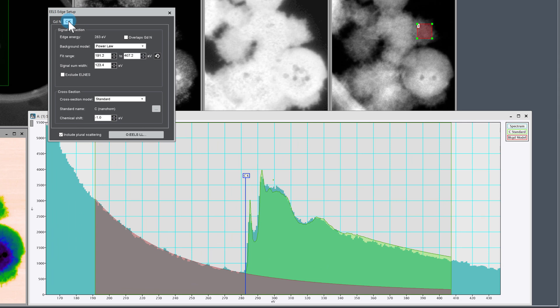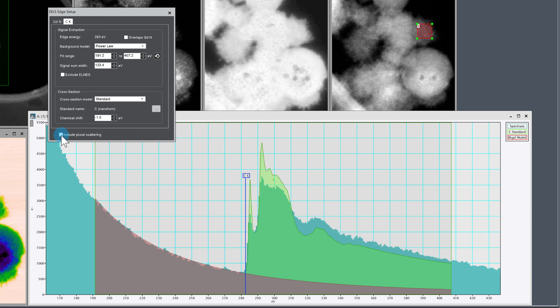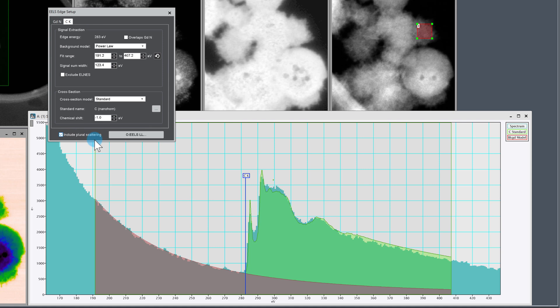So one thing that we can leverage here because we're doing dual EELS and we have low loss is plural scattering correction. So you can see the difference. If I turn off the plural scattering correction, the fit basically gets much worse. So it's really beneficial to have this switched on, especially for samples where the thickness is changing or different from the thickness of the specimen that we acquired the reference from.